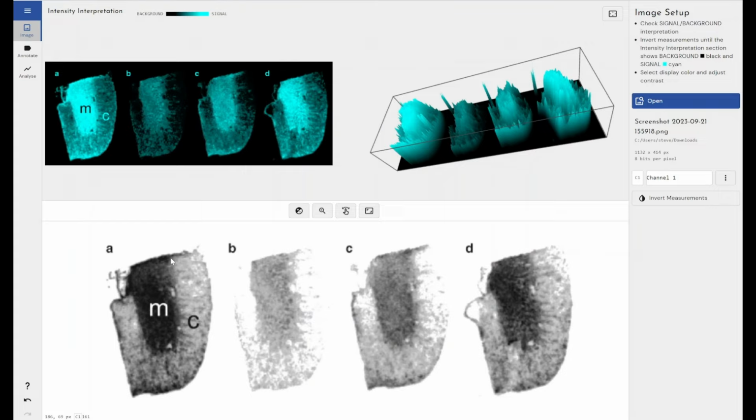So the idea here is that B represents the non-specific binding of my sample. So how much radiation, what will my image look like if I had just treated it with my radioactive isotope rather than my radioligand? What would be the background, essentially? The signal that I would get if there had been absolutely no binding of my ligand to my receptor, that is represented by B.